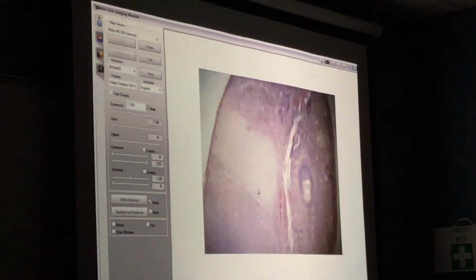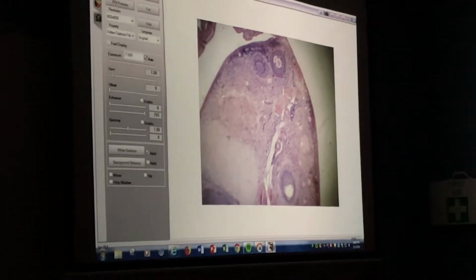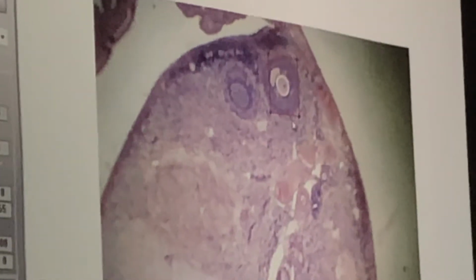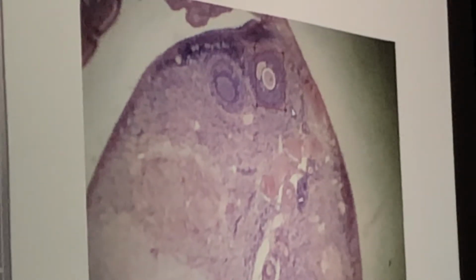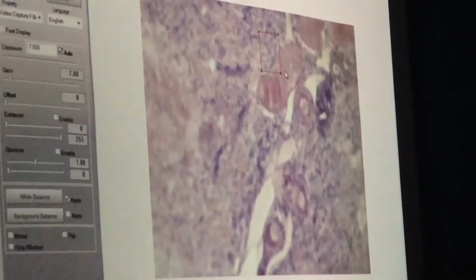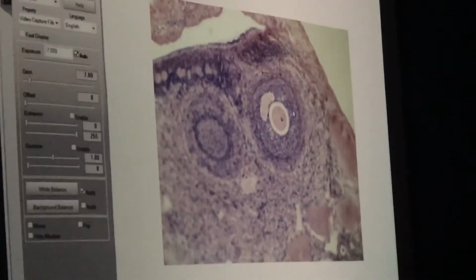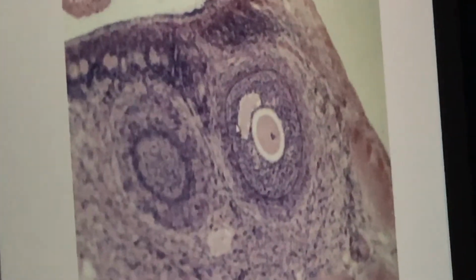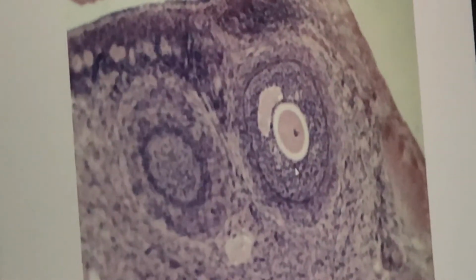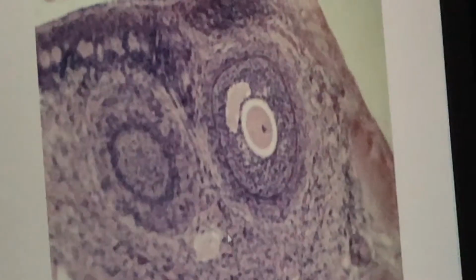Here's my whole ovary, right? And on the ovary, I can still see some follicles. So here's one right here. What would you guess this guy's going to be? Mature. Maybe, but maybe like late in the secondary phase. Let's bring that up a little bit higher power. And so if I say late secondary, why might I say that for this guy? The antrum. Yeah, it looks like it's just starting to have an antrum forming there. So this might be one that didn't make it to be a mature follicle in this particular cycle, right?